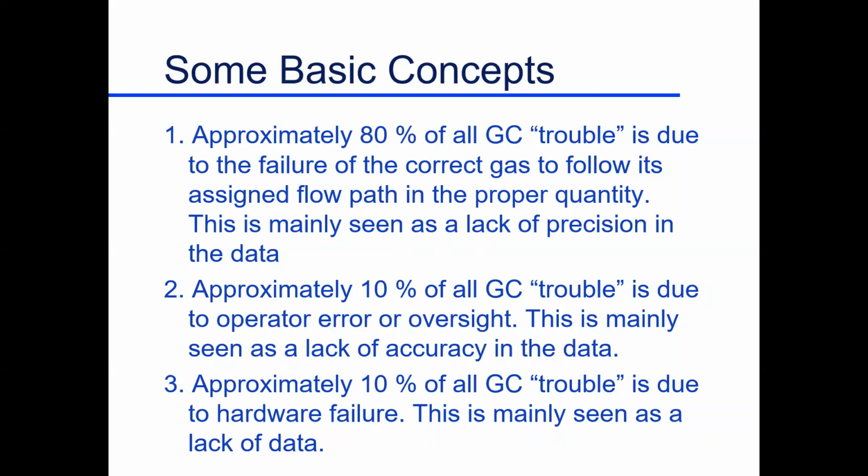Probably. Okay. So I'm going to be looking for stink in drywall. Somebody else will come in with a totally different problem, different materials, different compounds, different sources. So we tend to choose our columns so they're high efficiency, not super high. We don't choose them so they're super fast. We don't do routine things.